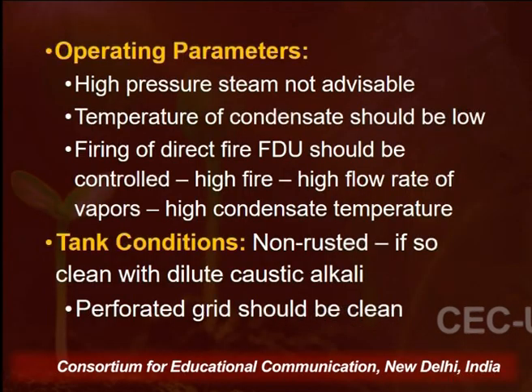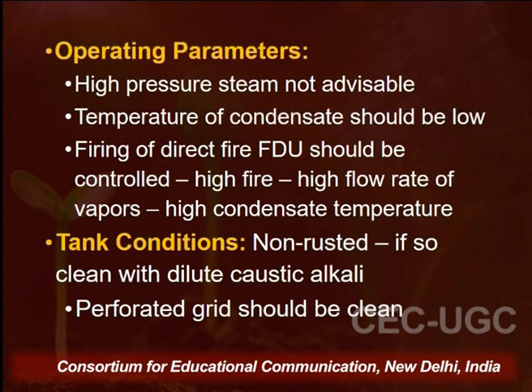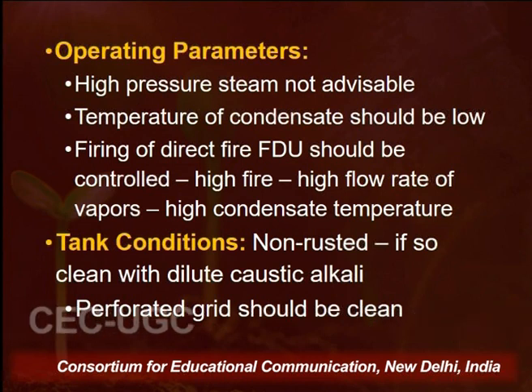Temperature of the condensate should always be low in comparison to the still, because if the temperature of condensate is very high, then proper condensation will not occur and we will lose a considerable amount of the oil. Firing of the direct field distillation unit should be controlled, as we discussed when we were discussing the field distillation units, wherein in the conventional field distillation units, we are not able to control the fire or the heating of the distillation units, thereby losing a considerable amount of the oil in terms of yield and quality.